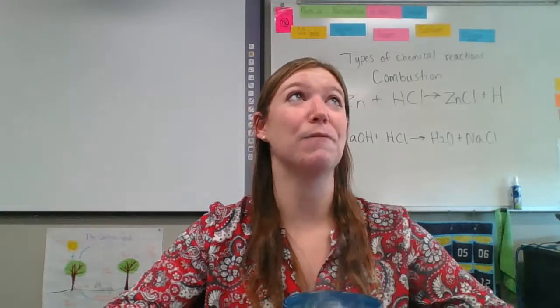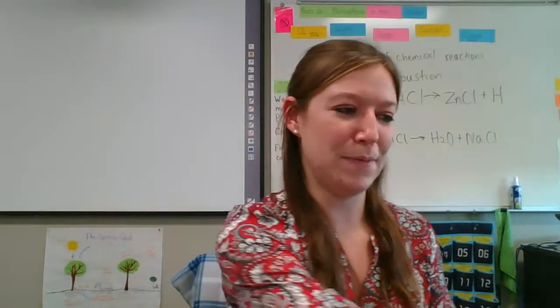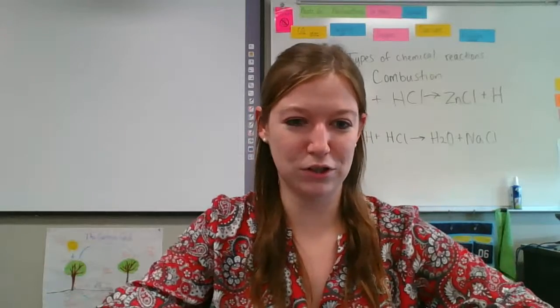Then the smoke that forms, we see some of that water vapor going away. Okay, so those are all the sort of basic ones, the kinds that you maybe could see every day. By the way, I'd like to point out this baking soda and vinegar is still going. It's crazy. All right, I'm going to pause it for just a second in order to put on my safety gear.